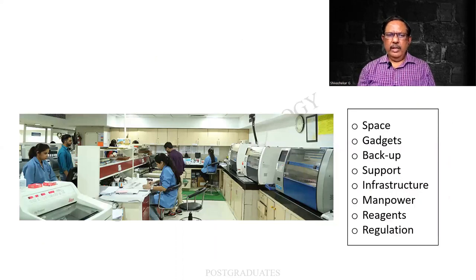And look at the modern lab, the concept of it basically. Look at the space that is there. And always you find that there are no enclosures. This kind of design was appreciated by one of my professors, Dr. Ramesh Rao, so that if you are in charge of the laboratory, you stand in one place and you have an entire vision of the laboratory, or vision of the entire laboratory. That's a better word.